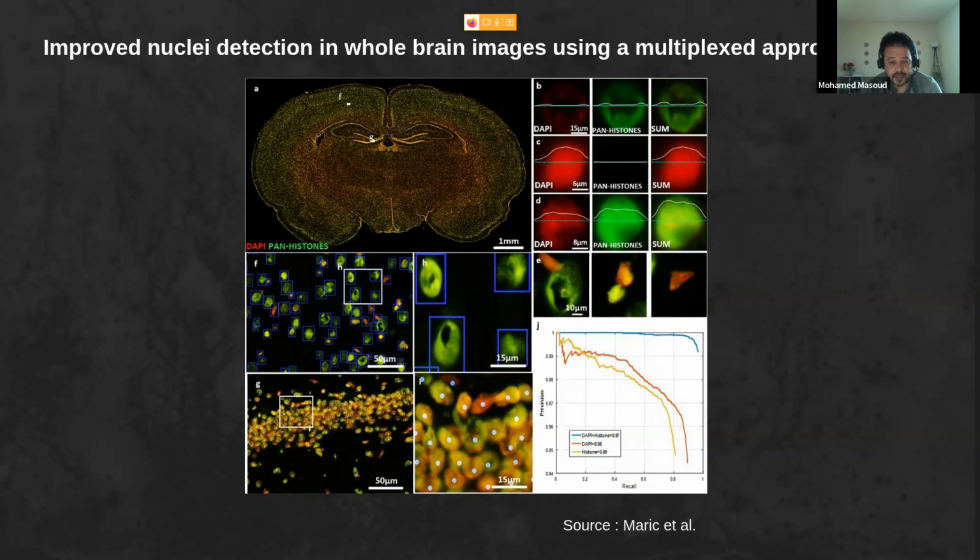So in this case, they used Faster R-CNN as a real-time object detection method that can propose multiple regions, and based on those regions, they can localize the cells separately.